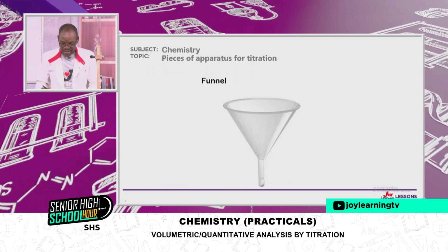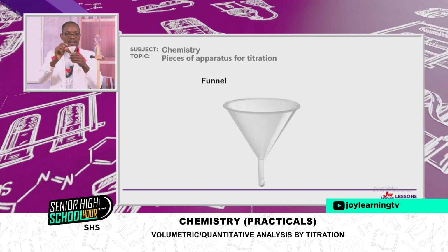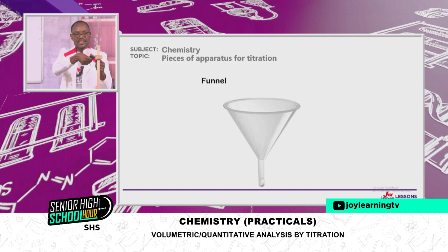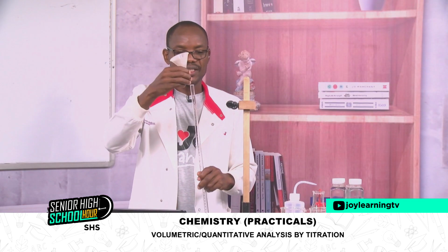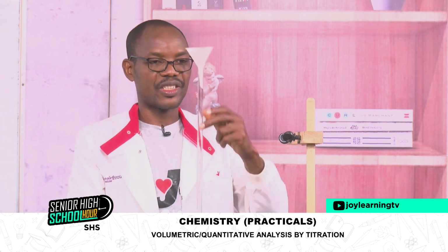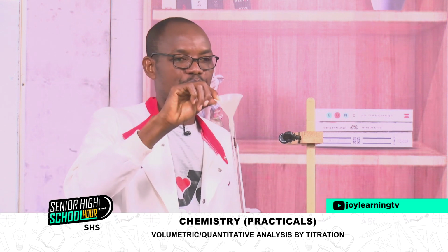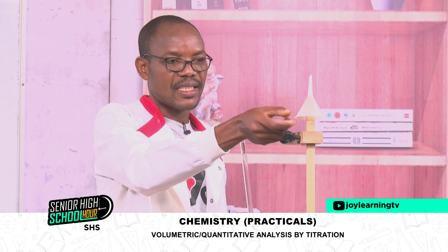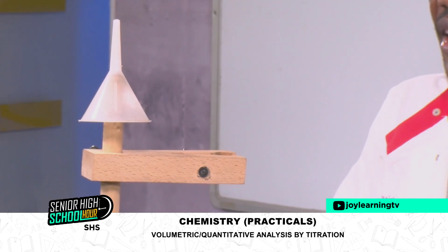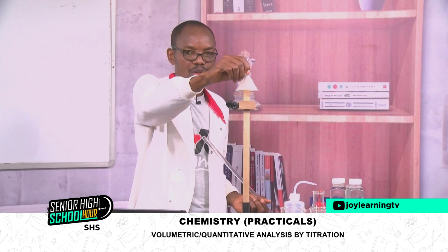The next one is the funnel. So I have my funnel here. The funnel is to help me fill the burette. So I have it like that so that I can fill it with a solution. The position of the funnel should always be on top of the burette like this. So always when you see it, it should be there. If I take it off after using it, I return it to its position.